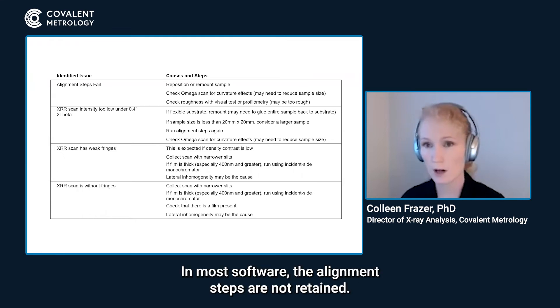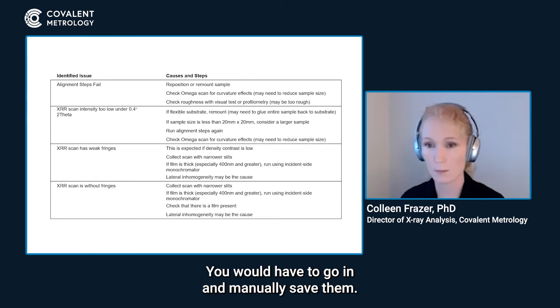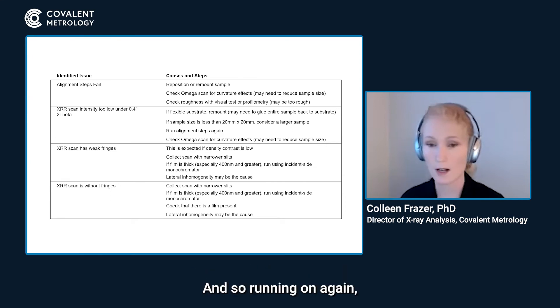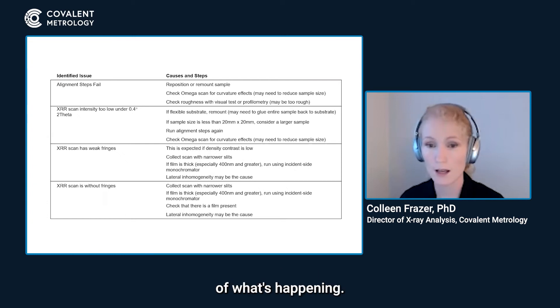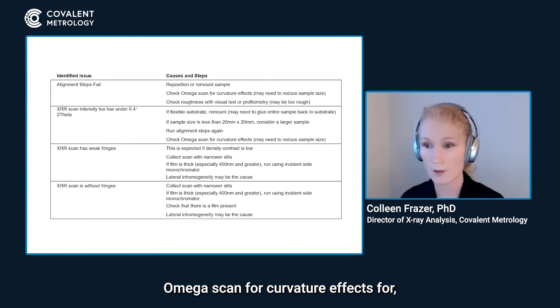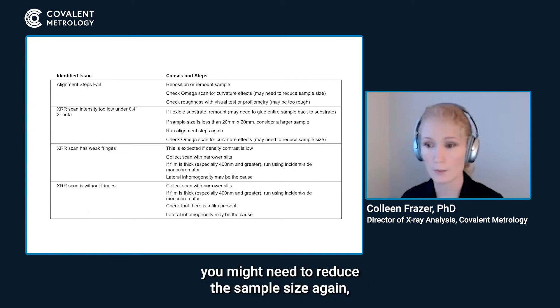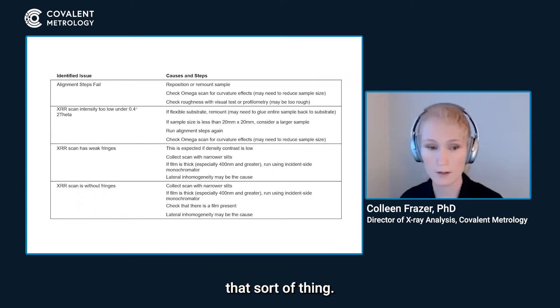In most software, the alignment steps are not retained — you would have to go in and manually save them. Running them again and saving the steps can give you a better idea of what's happening. You also want to check and scan for curvature effects, and you might need to reduce the sample size again.